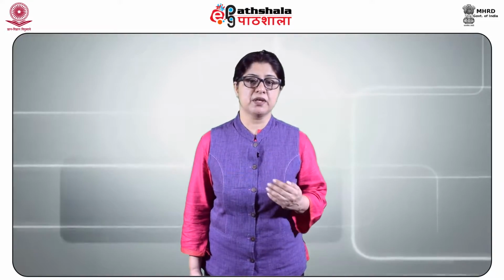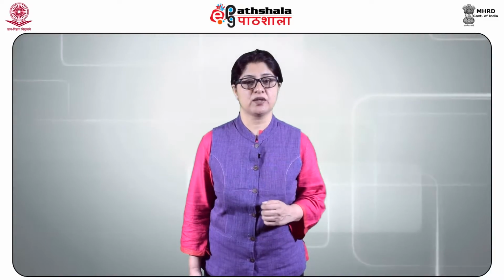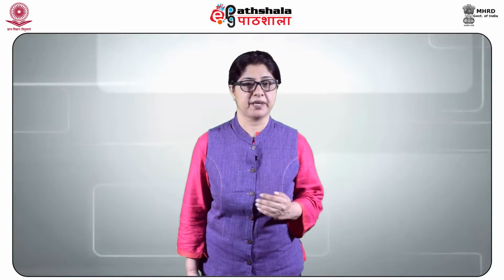Gas chromatography is similar to column chromatography, except that a gas is used as a mobile phase instead of a liquid. In gas liquid chromatography, which is GLC, the stationary phase is a thin layer of non-volatile liquid bound to a solid support. Separation takes place by the process of partition. On the other hand, gas solid chromatography, GSC, utilizes a solid adsorbent as a stationary phase and separation takes place by the adsorption process. Gas liquid chromatography is more popular than gas solid chromatography and has relatively more applications.